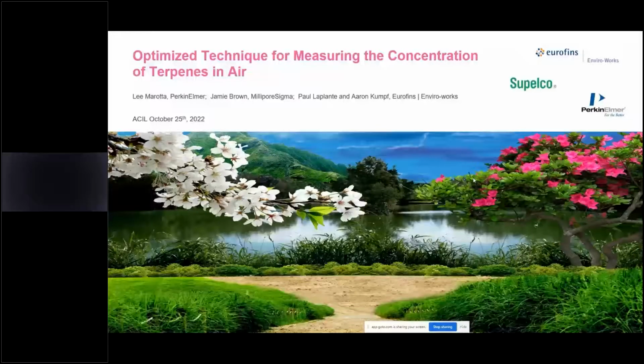I'd like to introduce my co-authors, Jamie Brown of Millipore Sigma Supelco. Jamie did a lot of research, which I will be getting into in this presentation. He designed a new thermal desorption tube specifically for terpene analysis, so it's an optimized recipe.